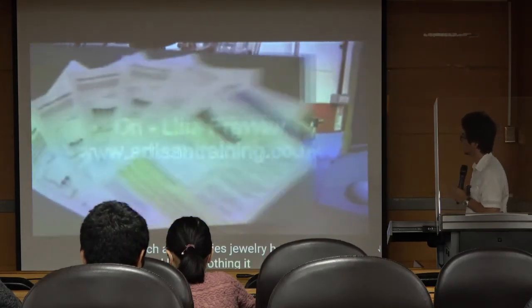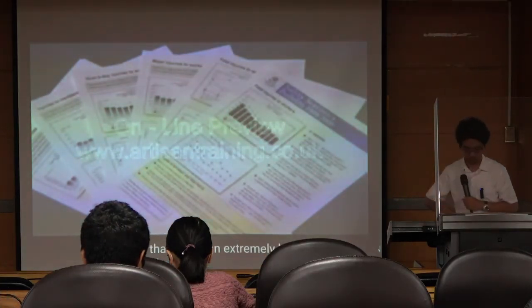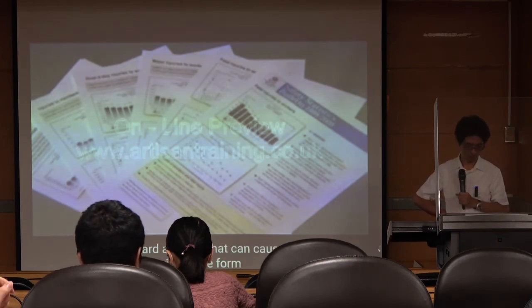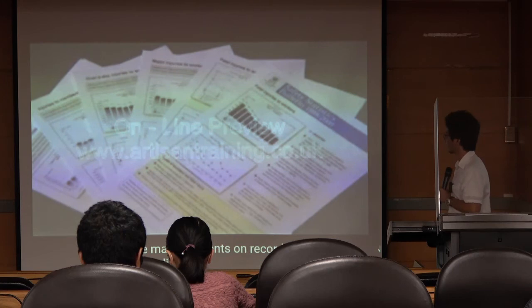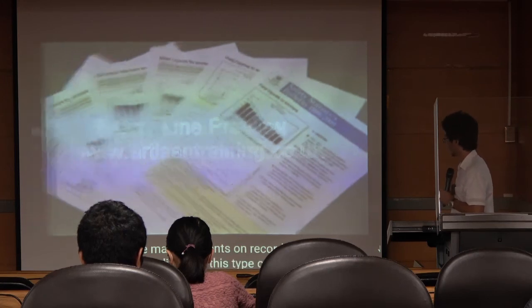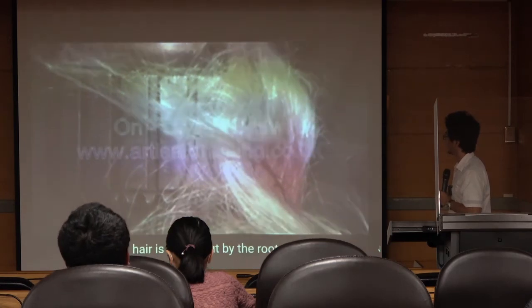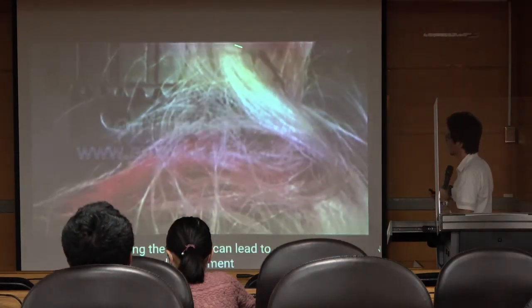Especially, yeah, if your head is caught by the rotating machines, it will be like this one.